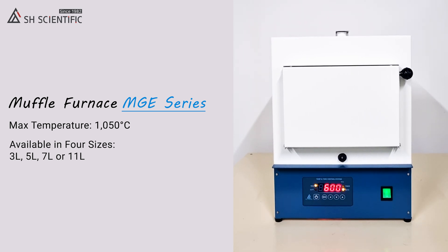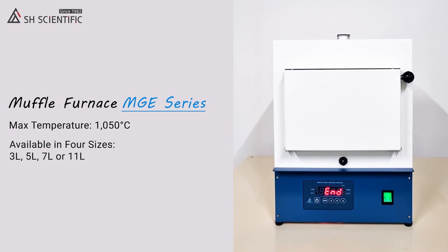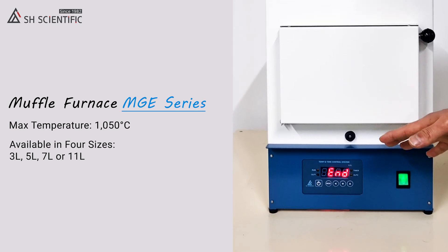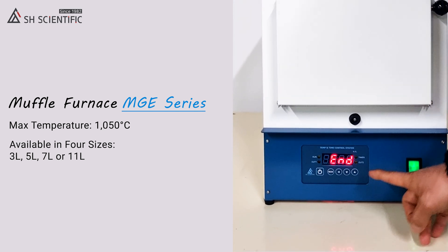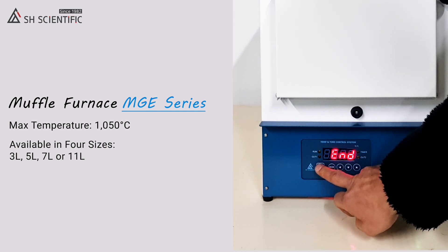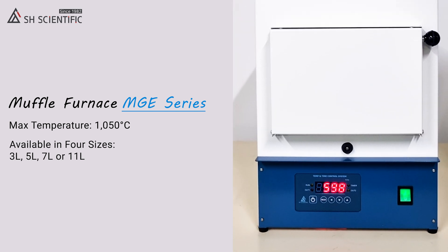Time is up. Run, Out 1, and Out 2 are all off, and the Beep Alert has started. Finally, we'll press the Power button one last time to stop the beep and shut off the furnace.